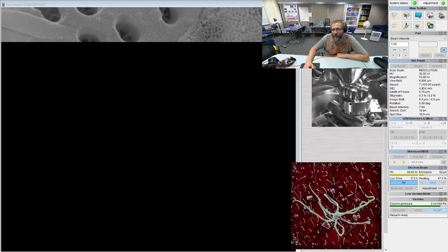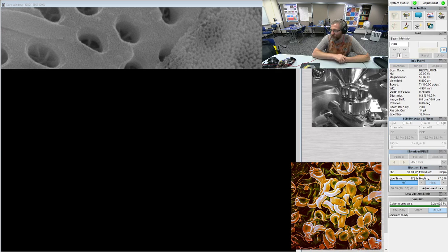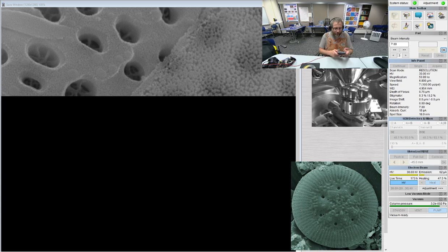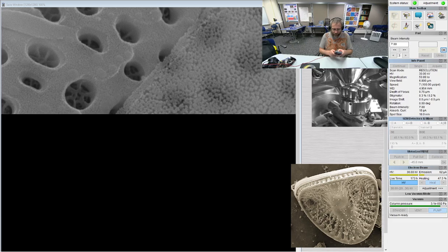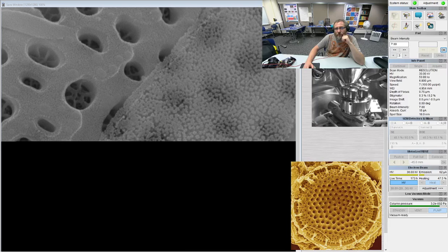What part of the world are these from? Yeah, you can answer some questions. So what part of the world is this from? This is from a lake that was buried in ash, in the northeast corner of Nebraska. It's part of a project looking at two lakes about 20 miles from each other. One was buried in an ash deposit from the Yellowstone supervolcano about 12 million years ago. Then 6 million years later, the exact same thing happened, where a neighboring lake got buried from a subsequent Yellowstone supervolcano eruption. So within 20 miles of each other, we can move up about 6 million years and find, I wouldn't say completely different diatoms, but they're pretty different.